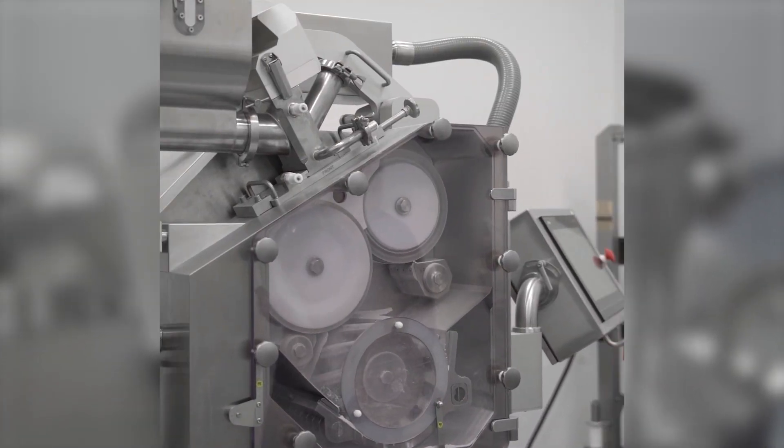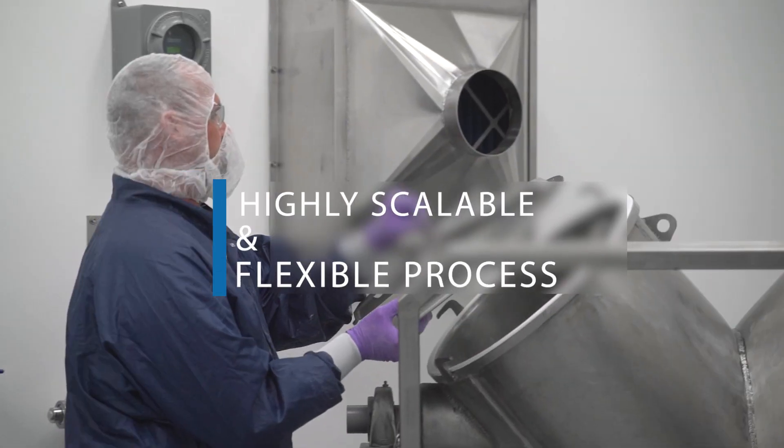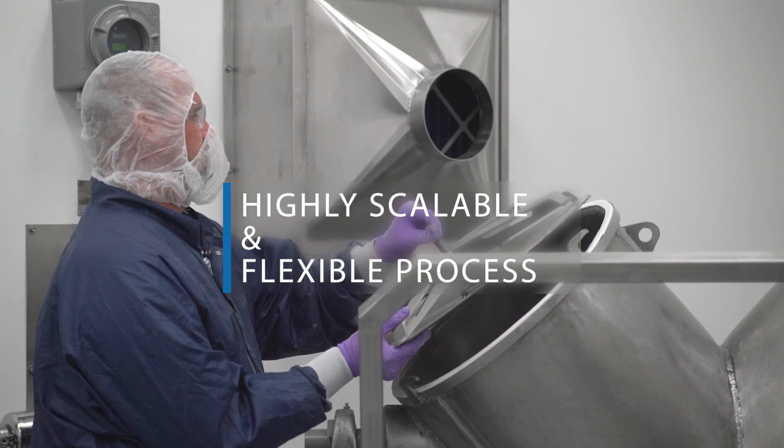Catalan roller compaction technology allows for flexible manufacturing, handling throughputs from 100 grams to 500 kilograms an hour, with a sealing system in place to reduce fines. It is an ideal platform to support both pilot feasibility programs through GMP commercial scale manufacturing with a quick and seamless scale-up process.